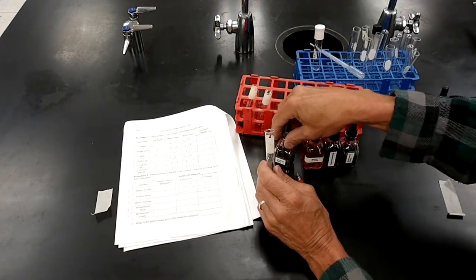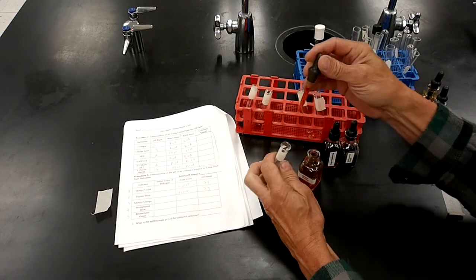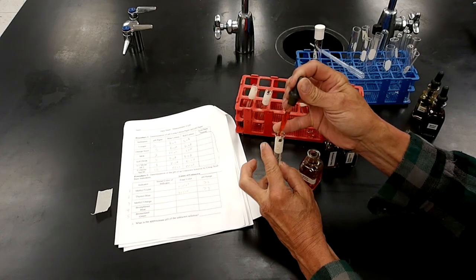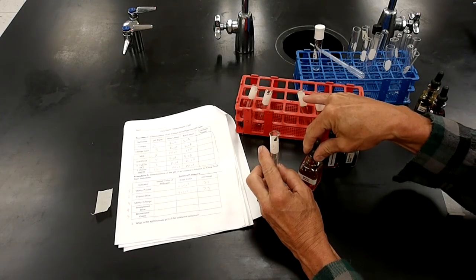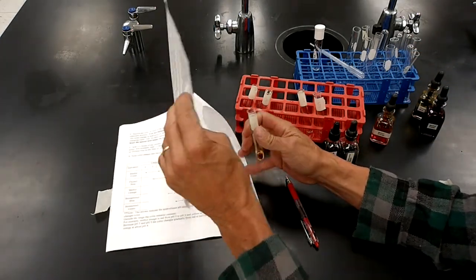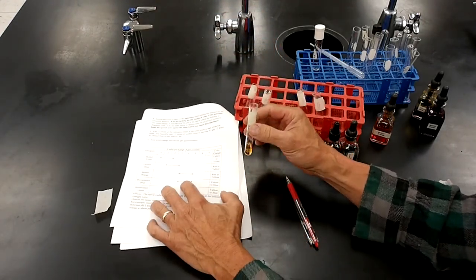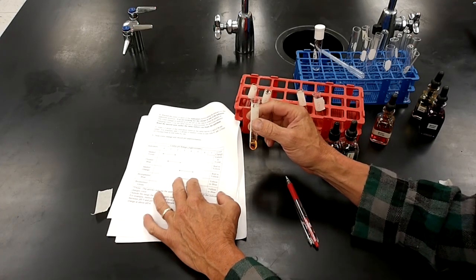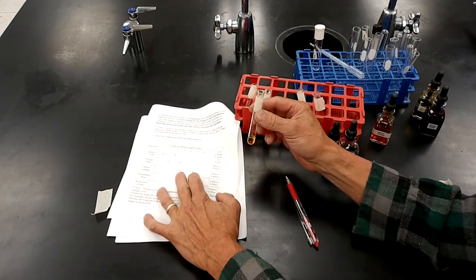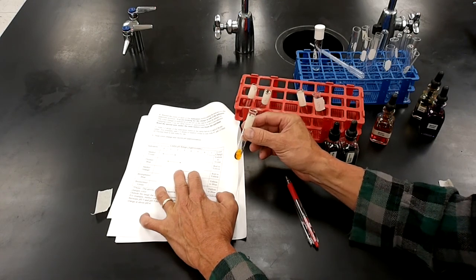Methyl orange. And 1, 2. All right, there's my methyl orange added to my unknown. Let's see, methyl orange. Below 4, it's going to be yellow. Oh, sorry. Reading the wrong one. Below 4, it's going to be red.